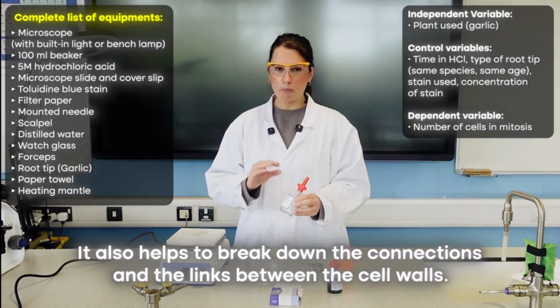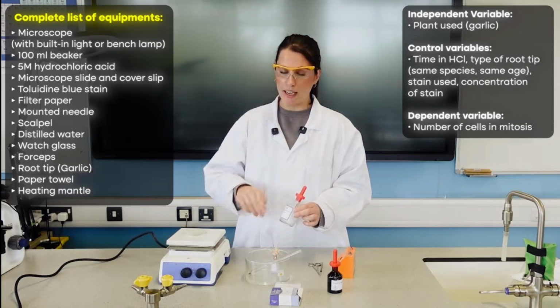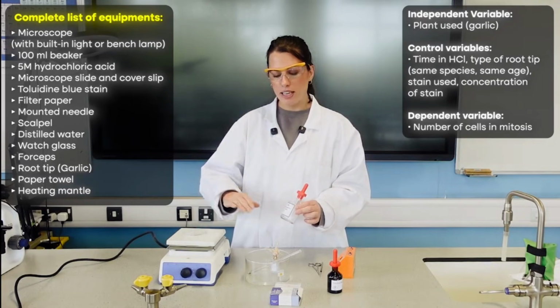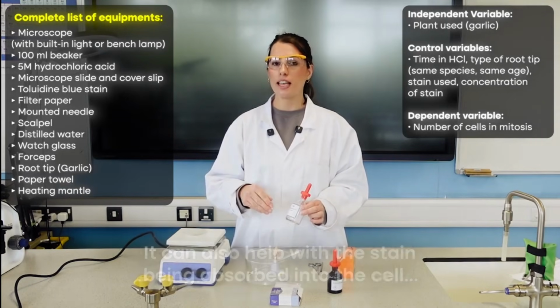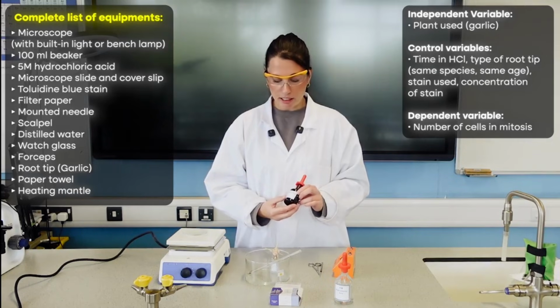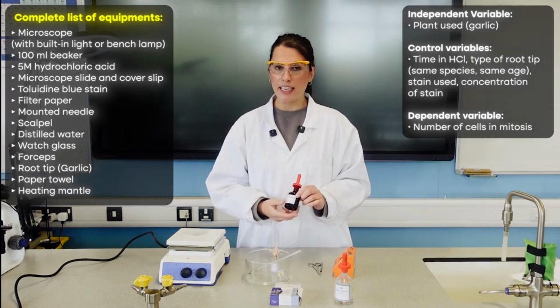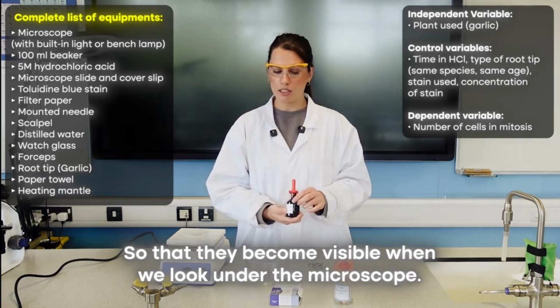It also helps to break down the connections and the links between the cell walls so that when we squash it, we do get a single layer of cells, and it can also help with the stain being absorbed into the cell and the chromosomes getting stained. That takes us on to the stain, and I'm actually using toluidine blue for this, and this will stain the chromosomes so that they become visible when we look under the microscope.